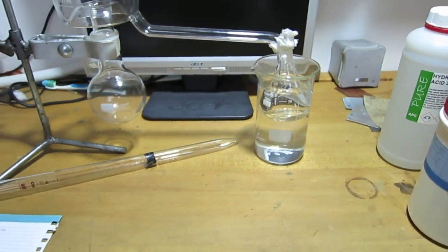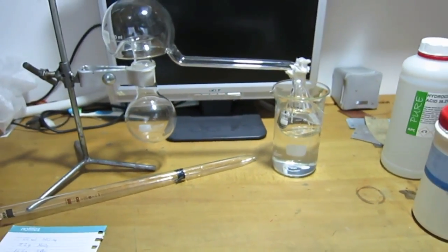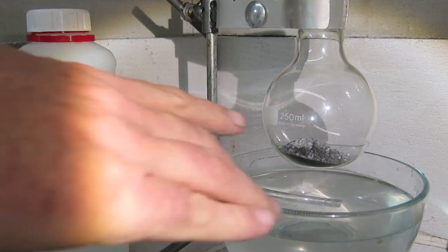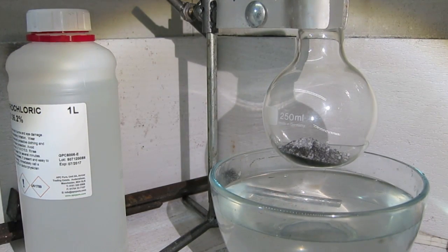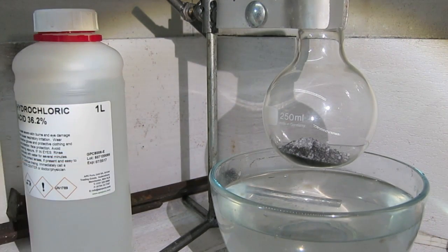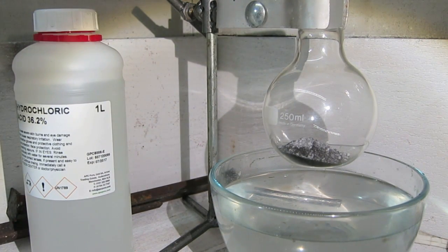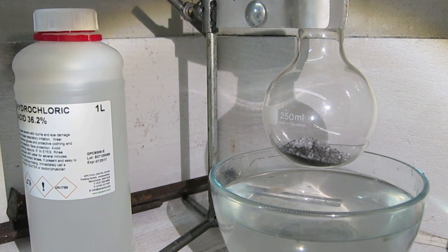Okay, so now we're going to set it up. Here the mixture of the KBr and the MnO2 is in the round bottom flask, and here's the hydrochloric acid, which I will add to it. And this is the water, in case something goes wrong, everything falls into the water, which is better than free bromine gas floating around despite the fume hood venting running.